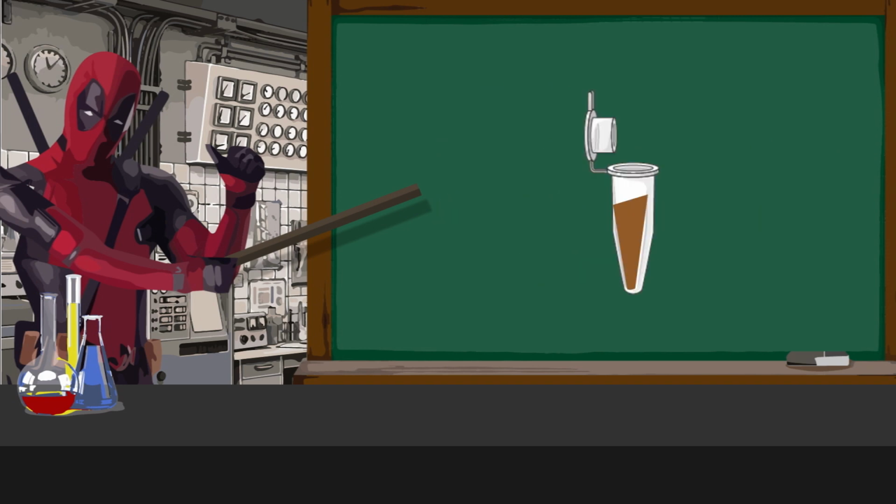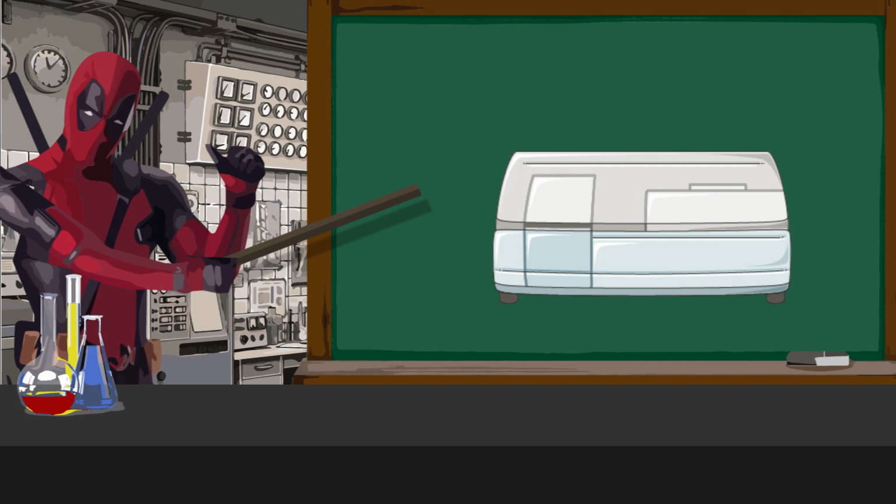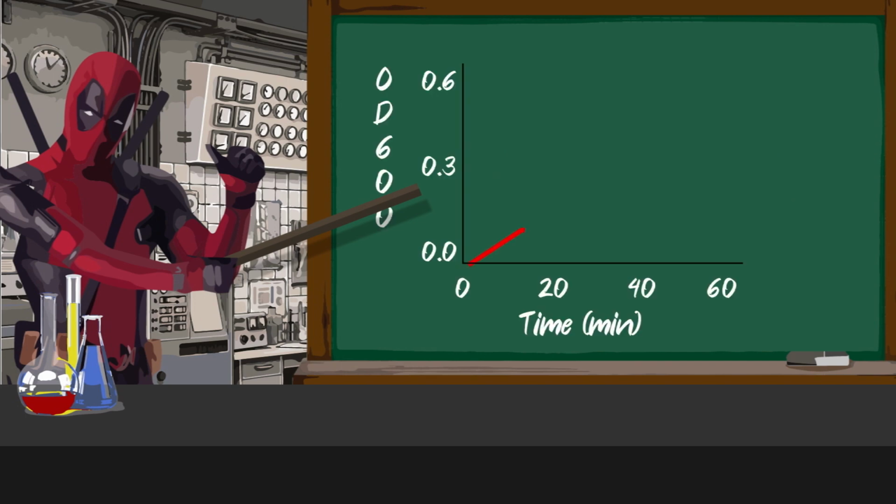To start the process, you need to add 12 milliliters of the LB and ampicillin to the 1 milliliter of overnight culture. Once you do so, you then observe and measure the OD600, just like in the graph right next to me showing the absorbance.